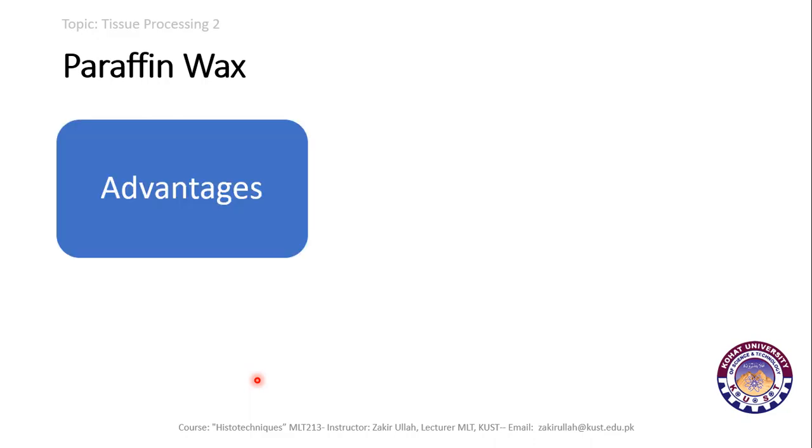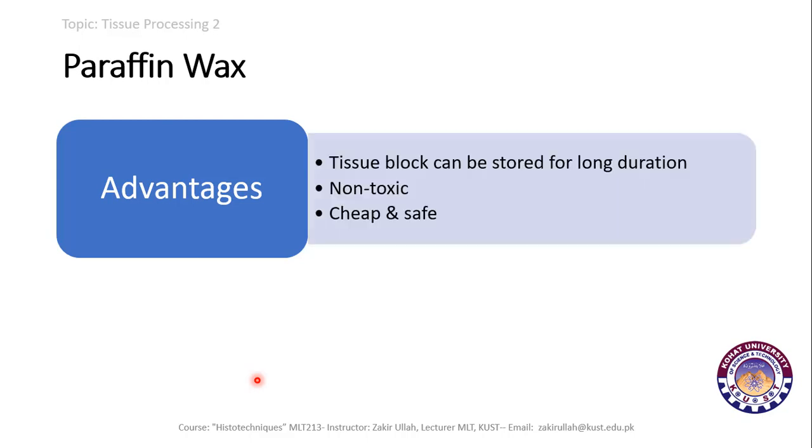The advantages of paraffin wax is the tissue block embedded with the paraffin wax can be stored for a longer time, and this is non-toxic, cheap and safe.